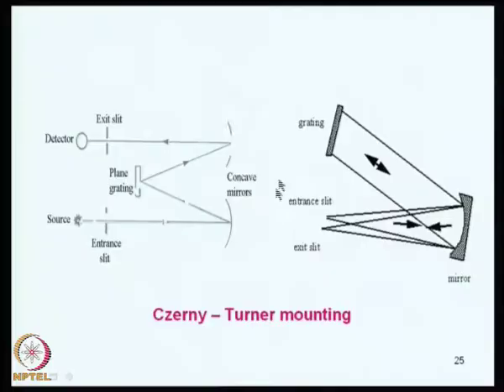So, you can have a permanent record of the emission lines, or you can collect the information in a computer and then determine the chemical analysis. So, in Czerny-Turner, photographic emulsion plates become redundant, because all the information is collected on the computer, and the data can be handled using typical software.